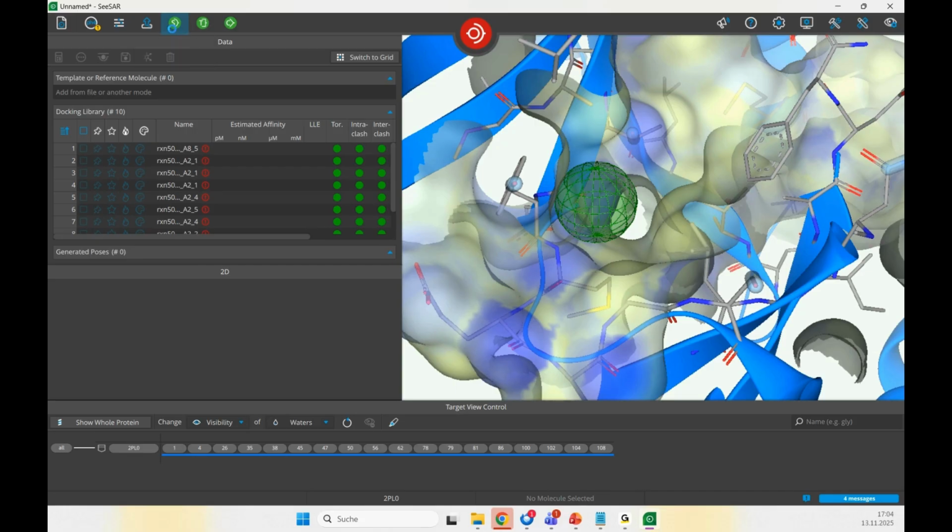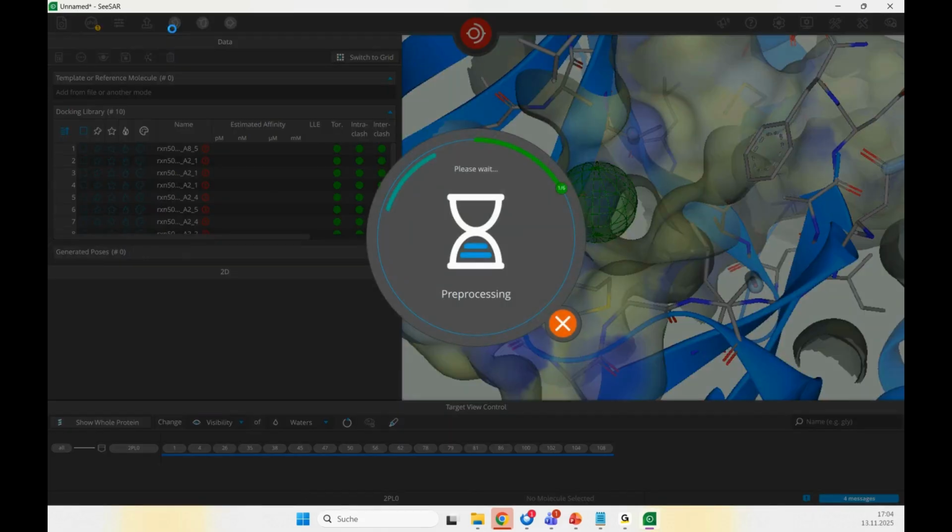Let's start the docking, I would say. We offer 3 different docking methods that we can check one by one. The standard docking is exactly how it sounds. You take your ligand, you throw it at the binding site, and you check for whatever survives. We're generating 10 poses per default, no constraints per default, but you can still apply pharmacophore constraints.